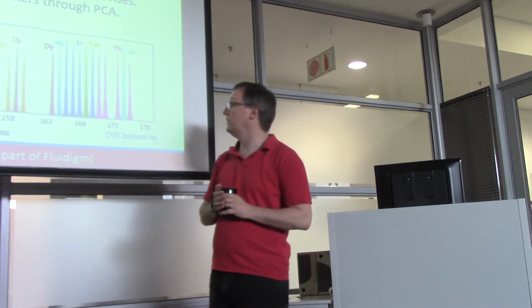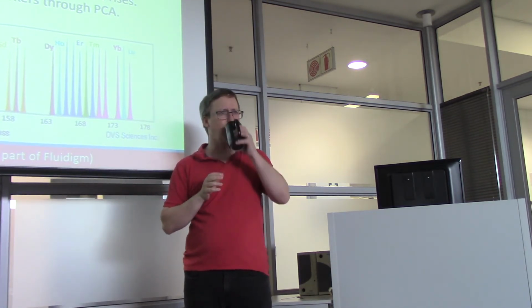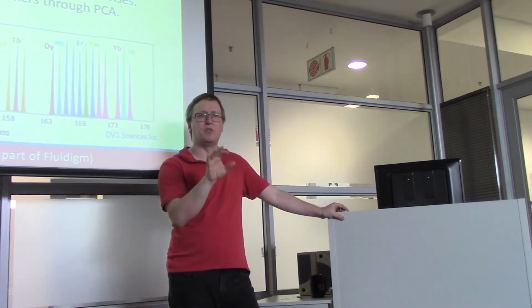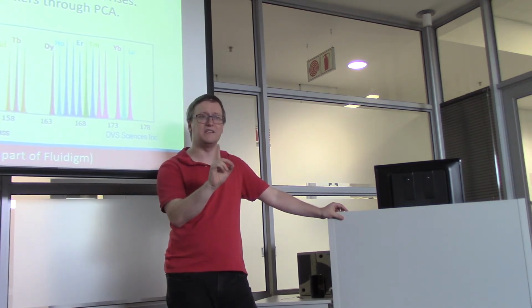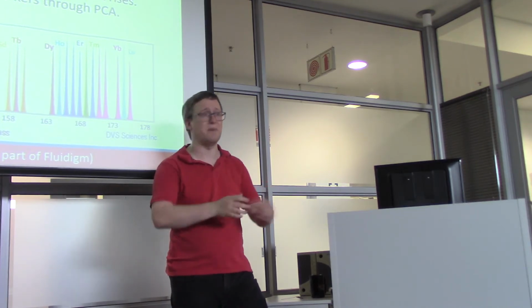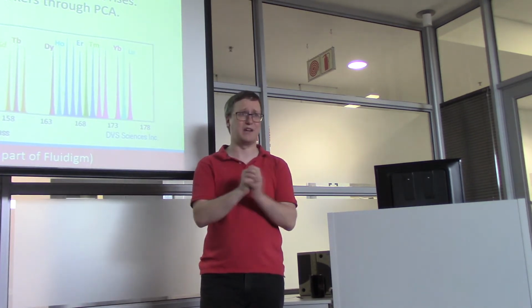This is particularly awful if you happen to be working with Cytof. Has anyone heard of Cytof? It's still a relatively new technology, maybe the last 5-10 years. Many people have said, look, the more colors you try to jam through these flow cytometers, the worse the problem gets. So why don't we stop dealing with fluorescence as our readout and instead use mass to charge and intensity as our readout? Mass spectrometry is a really great field for separating out a whole bunch of different signals that are all competing for this space because it can discern things with different mass to charge values very, very accurately.